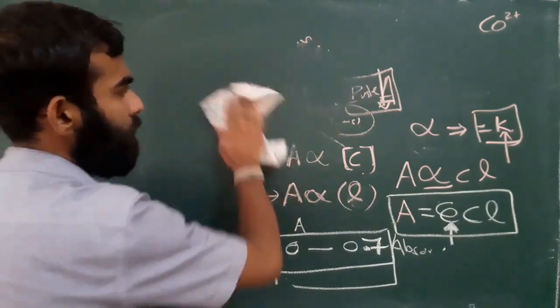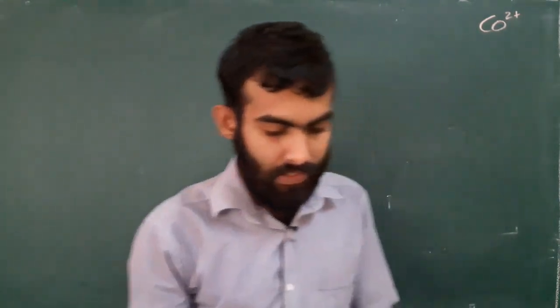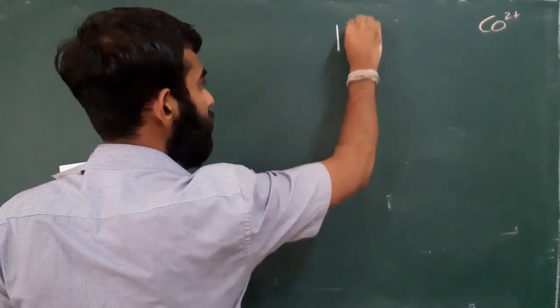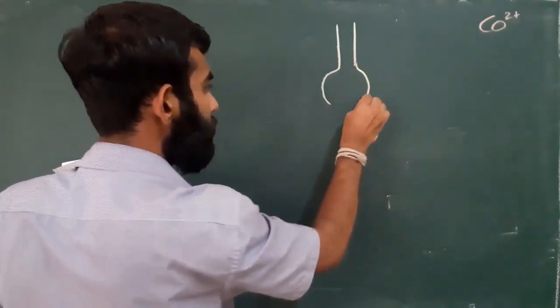Okay, now I am jumping to our experiment. We have been provided a stock solution of cobalt, a 1 M cobalt solution, in a volumetric flask.